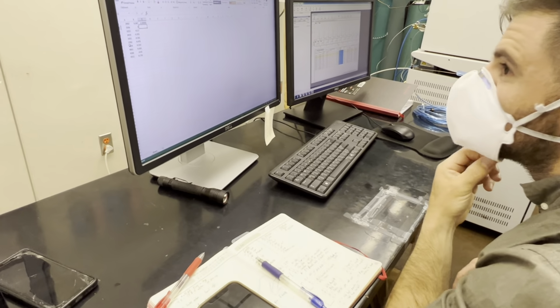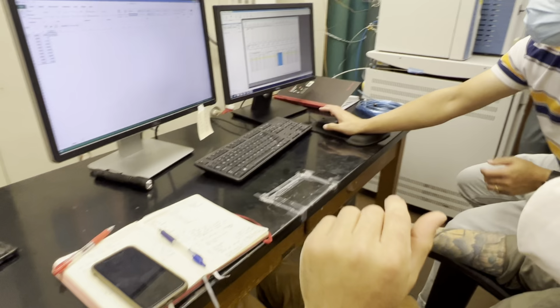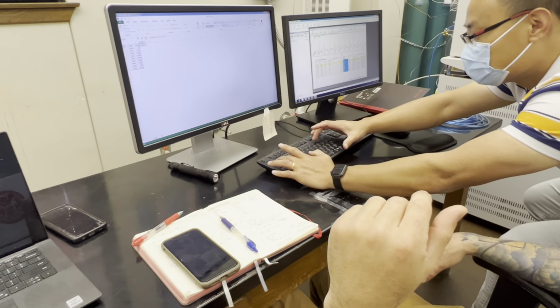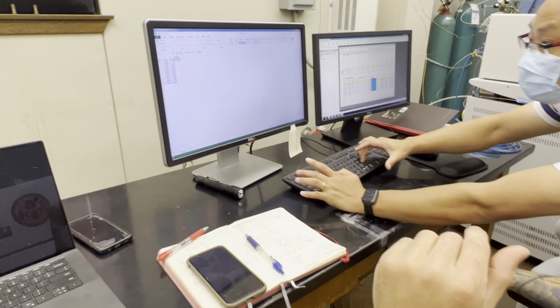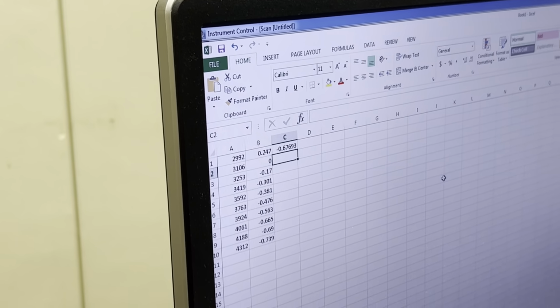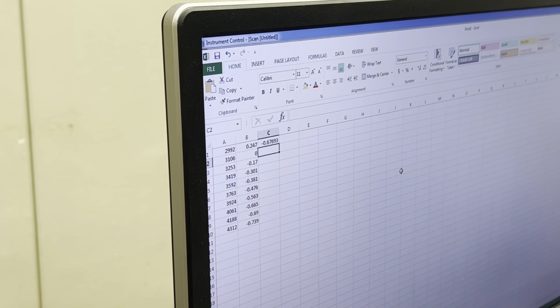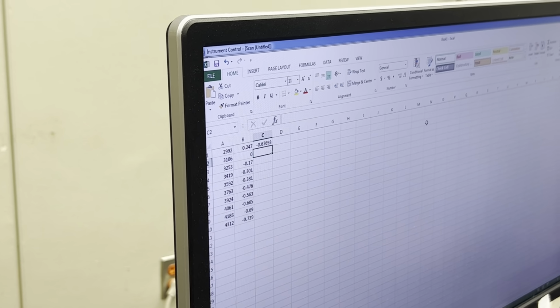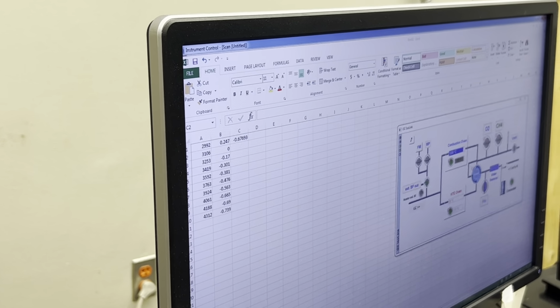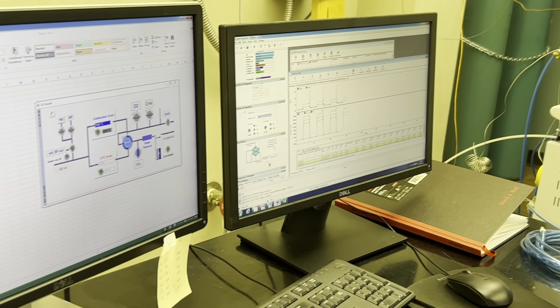It's a negative slope. It doesn't matter if it's negative or positive. It's just the slope. So this is the slope. So it's bad. But most things don't pass within the first round. That's why you're saying do it 20 times or whatever.